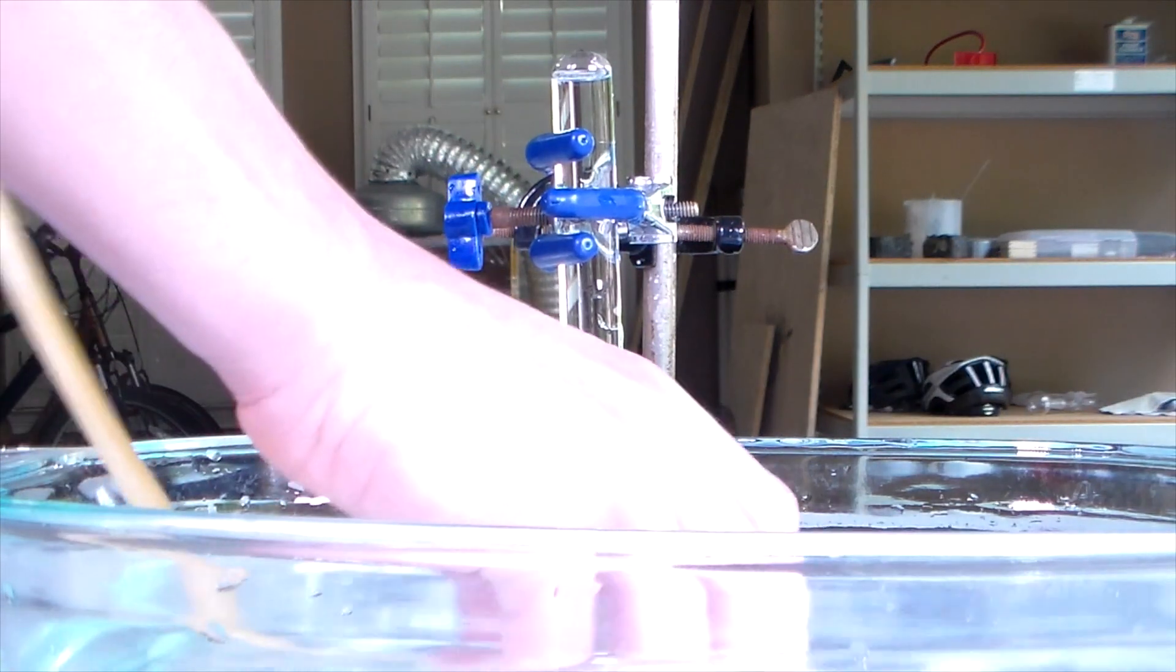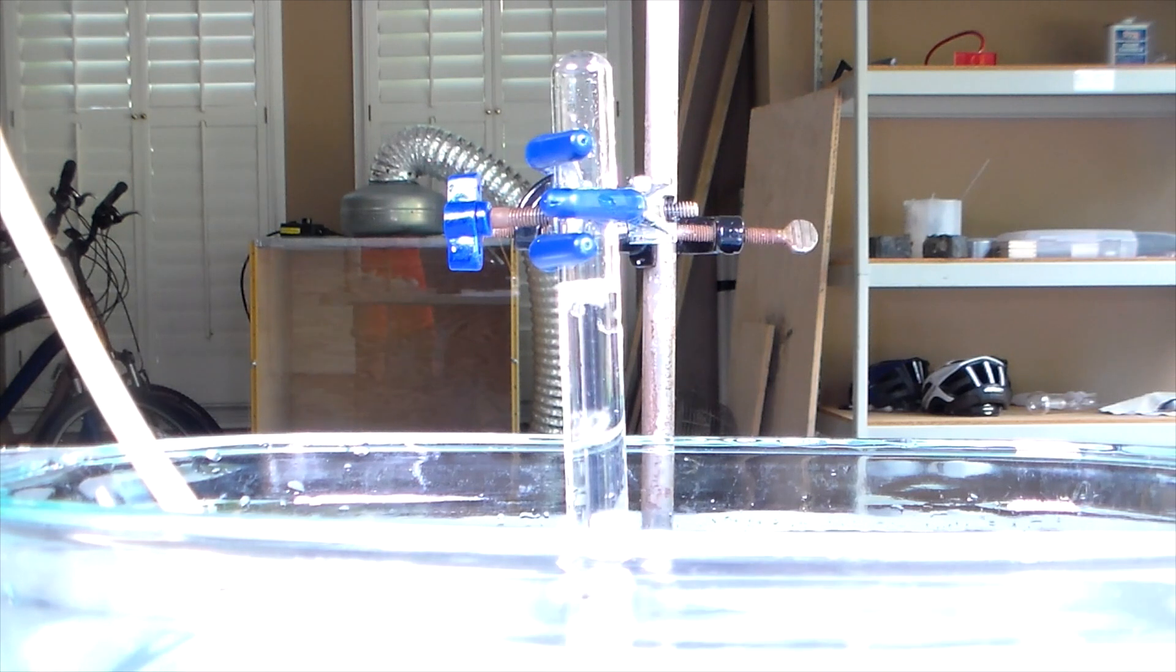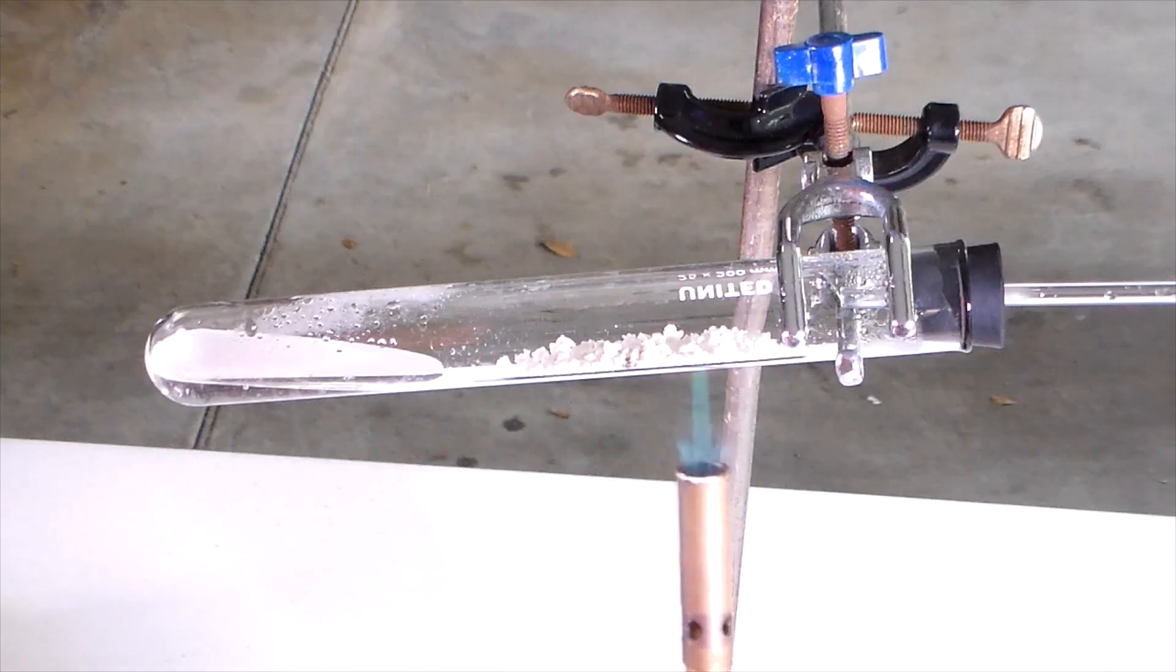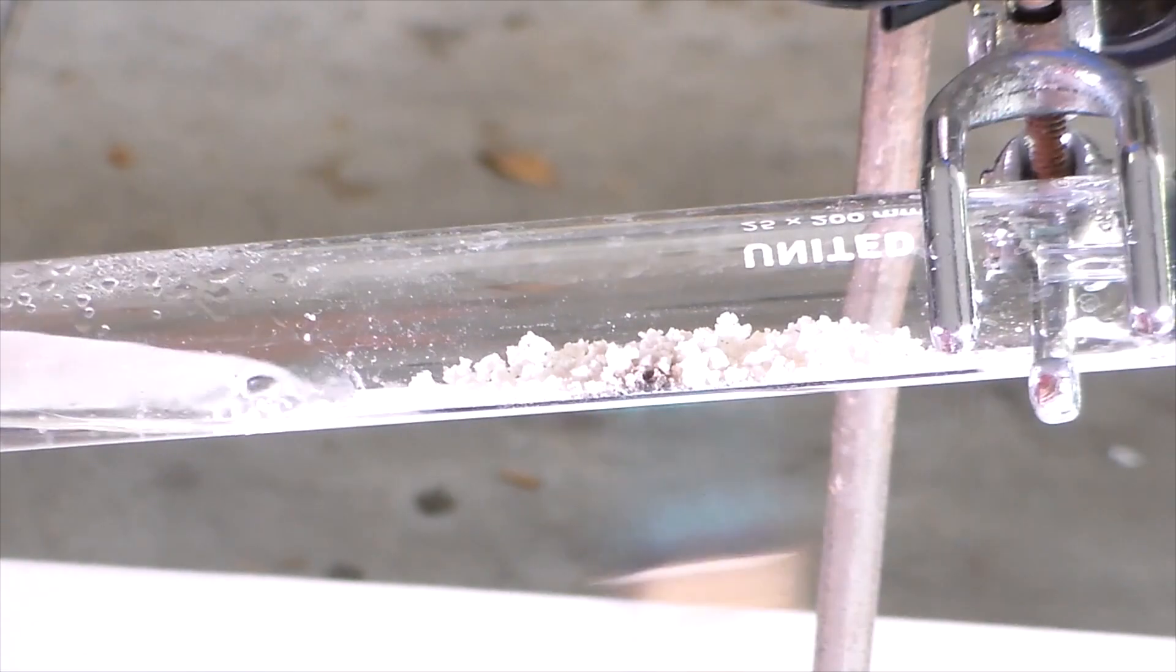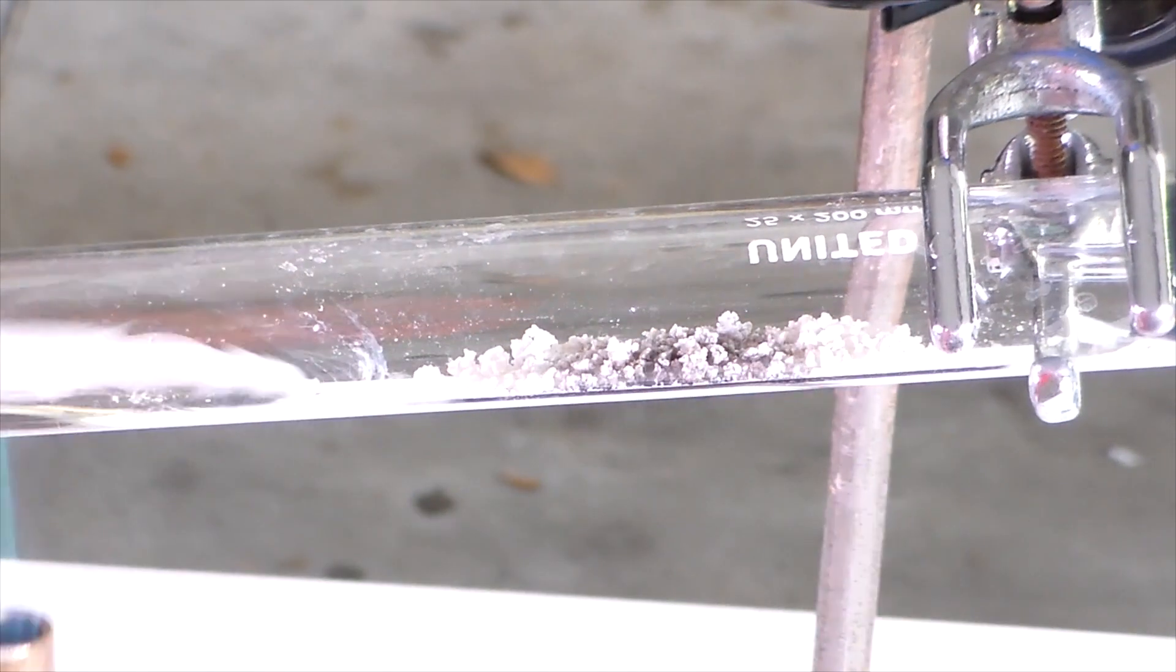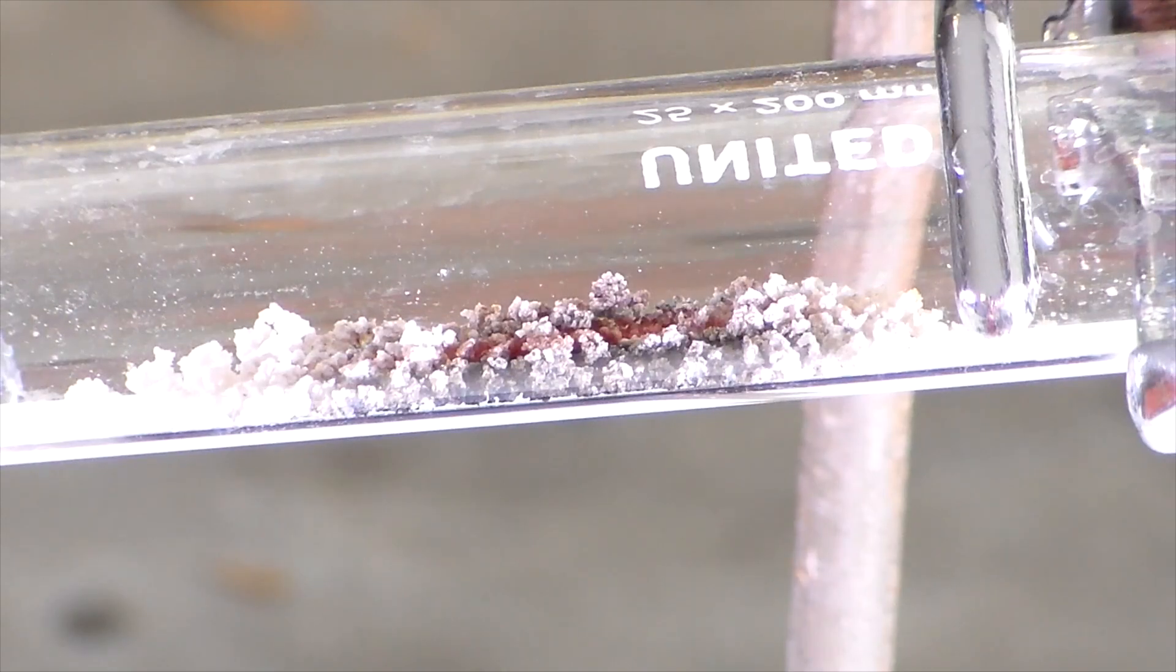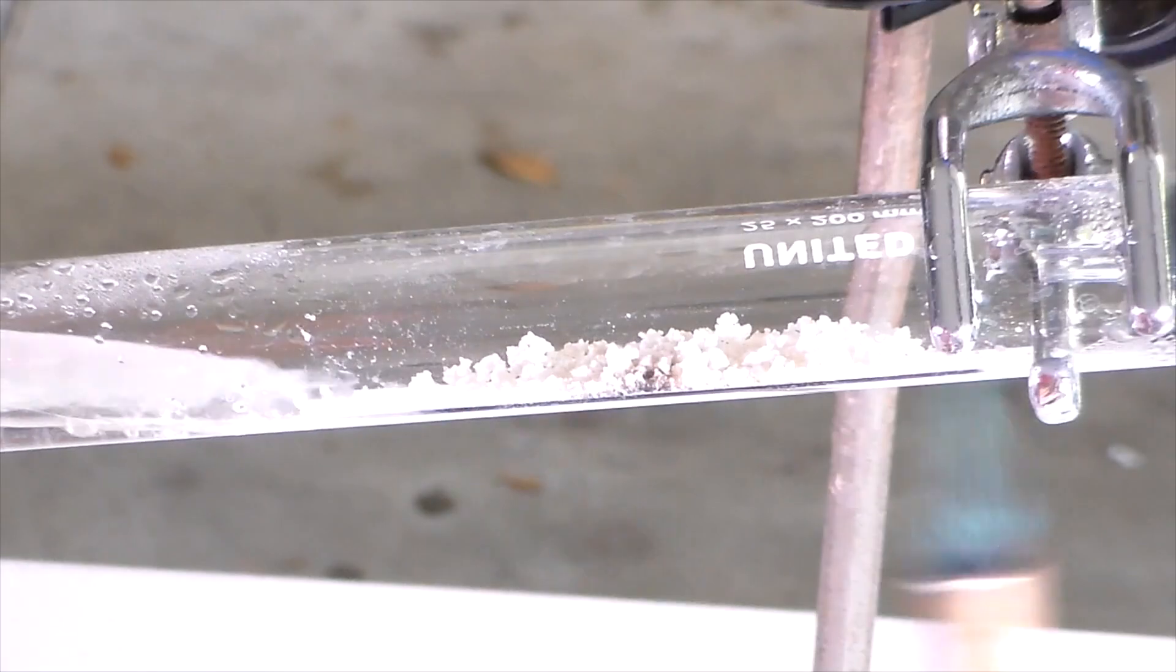Once you smell ethene, insert the plastic tube into the inverted test tube and collect the gas. An interesting side note is that the aluminum oxide catalyst turns black as the reaction progresses. I actually don't know why this is, and any suggestions in the comments would be pretty helpful.